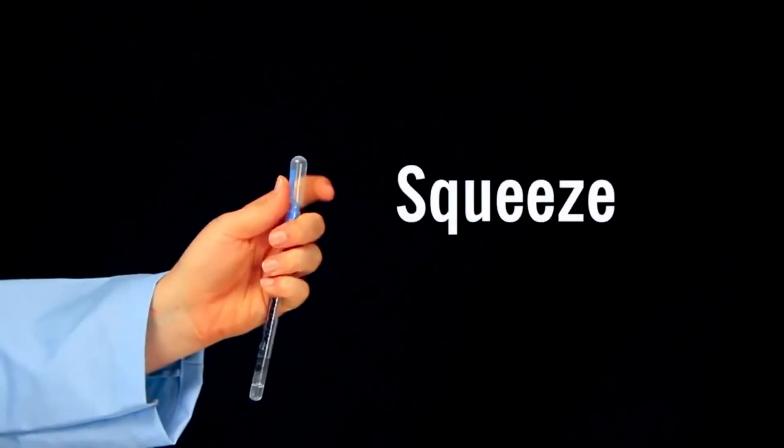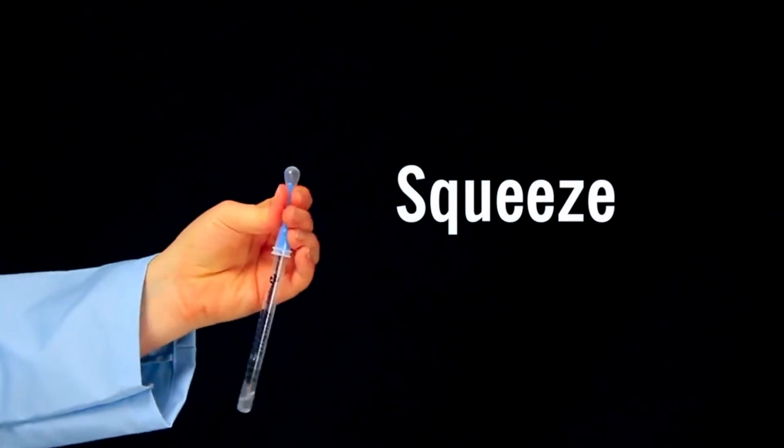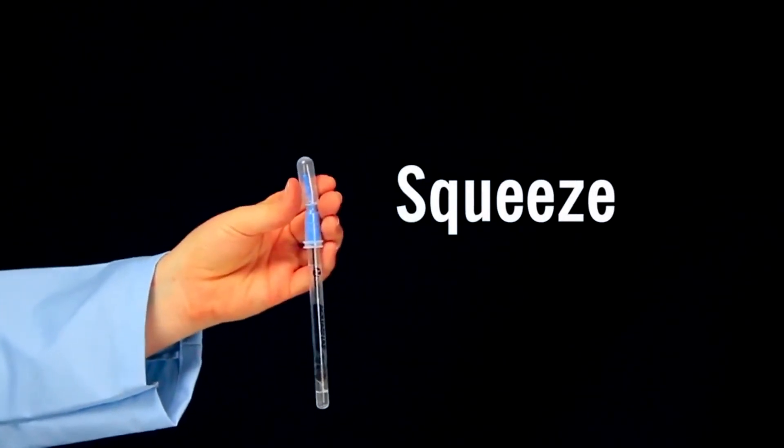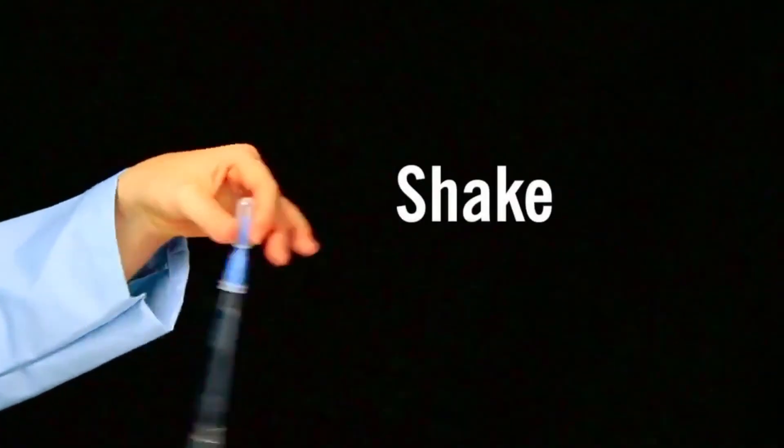The easiest way to activate AquaSnap is to hold the device in your fist and use the thumb and forefinger to break the snap valve by bending the bulb forward and backward. Next, squeeze the bulb twice to expel liquid into the tube. Then shake for five seconds.